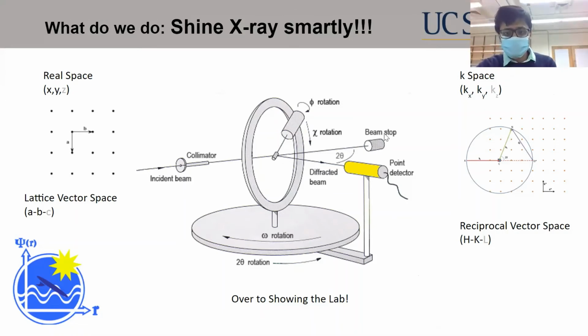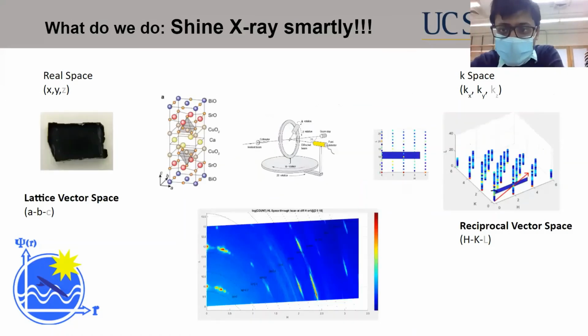So this is a good example of a thin sample. This is how the sample looks in real space. It is a black crystalline thing. Its surface is shiny, so it reflects off the light as you look at it, and it mimics a metallic thing at room temperature. It looks like a metallic thing, but it's actually way more complex than that.